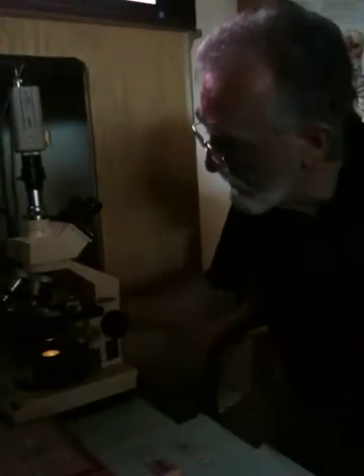Let's see, do we have all three? No, we don't. Most of the salivary glands I'm going to show you are going to be in larger form. They're hard to really get a good idea of, so let's pop this up a little. Now with salivary glands, you have to remember that being glandular in nature and exocrine, they're going to have follicles in them, similar to anything that has the ability to secrete out into the system.